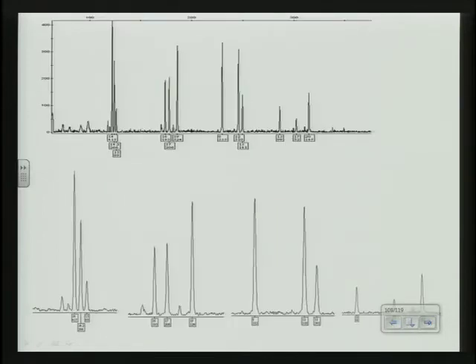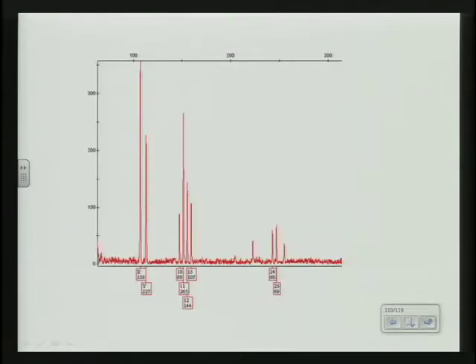This got a little bit cramped, so I broke it up. But you see, again, you've got this fairly major going down. It gets kind of 1-to-1, then a little bit less, and then down at the end, you only have 2 alleles that are detected. This one is below the analytical threshold. Same thing going on here. Start going down. This is actually a mixture of two males. But you go down, and again, you're seeing the ski slope effect, but with FGA, that's not unusual anyways.